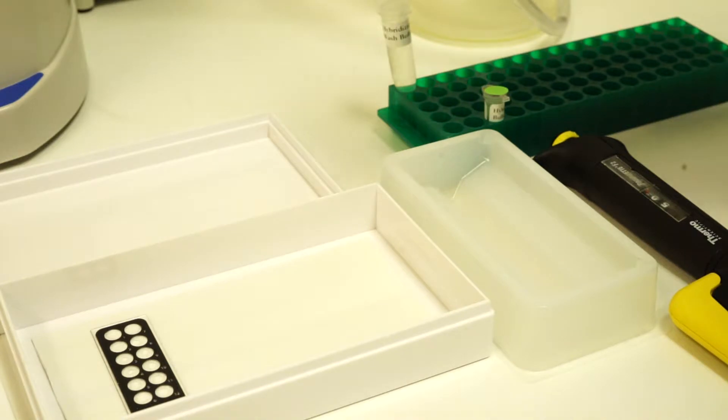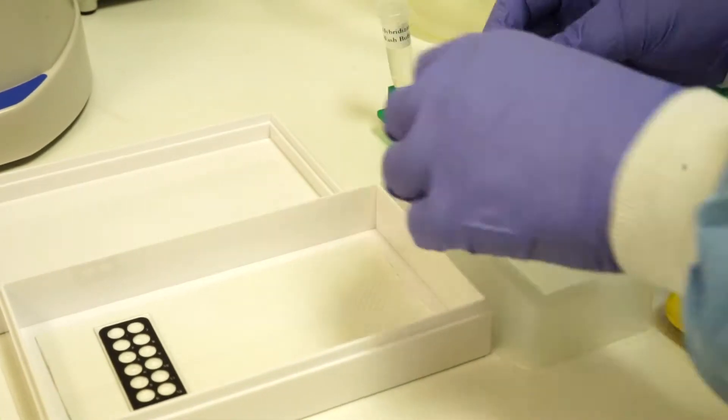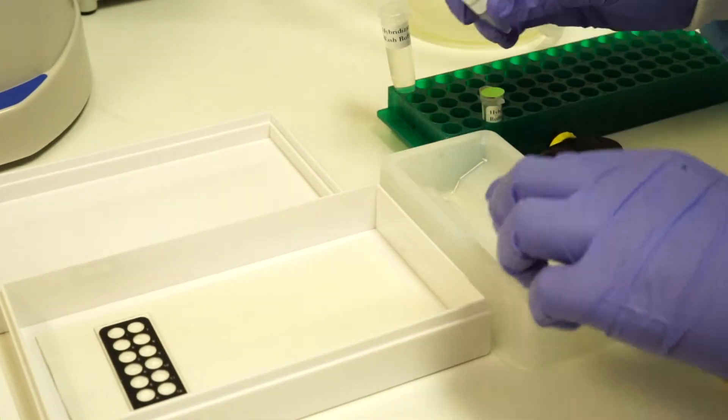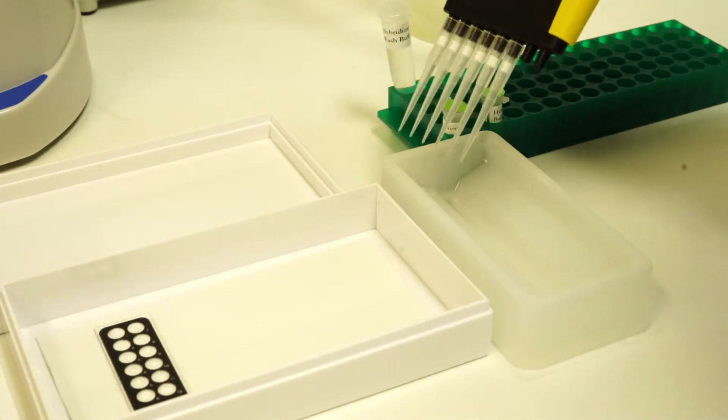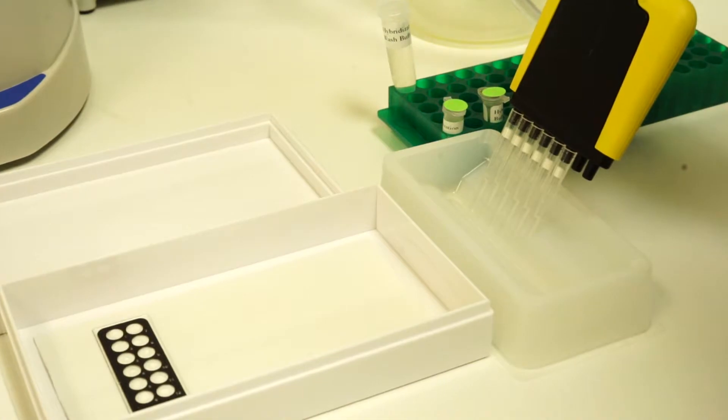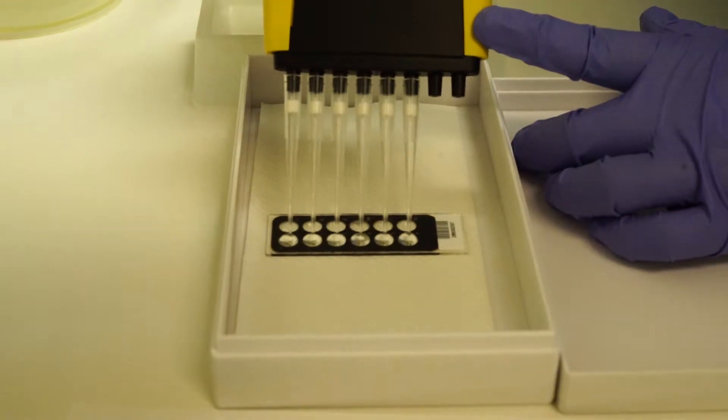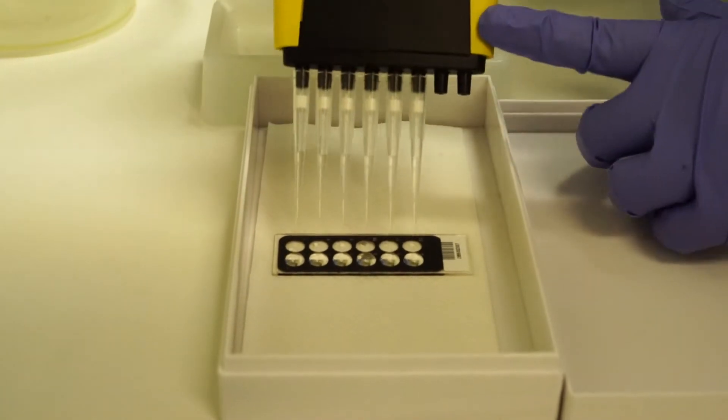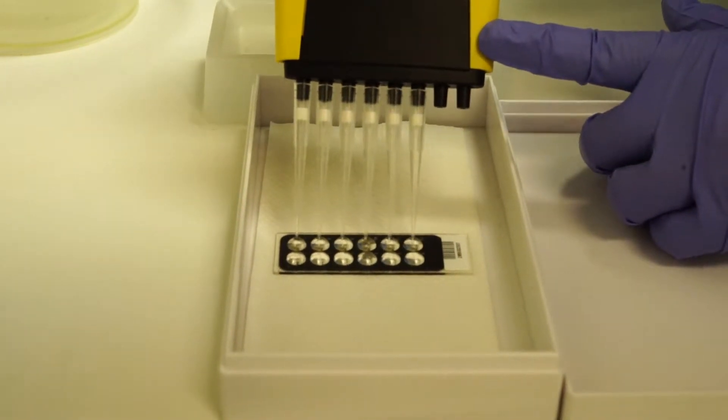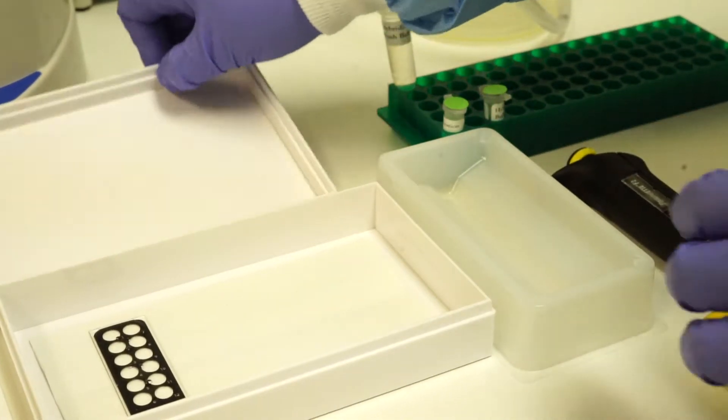After you have mixed your pre-hybridization buffer by vortexing, pour it into a new, clean pipette basin. Set your pipette to 50 microliters and carefully dispense into each of the wells. Allow this to sit for five minutes at room temperature.